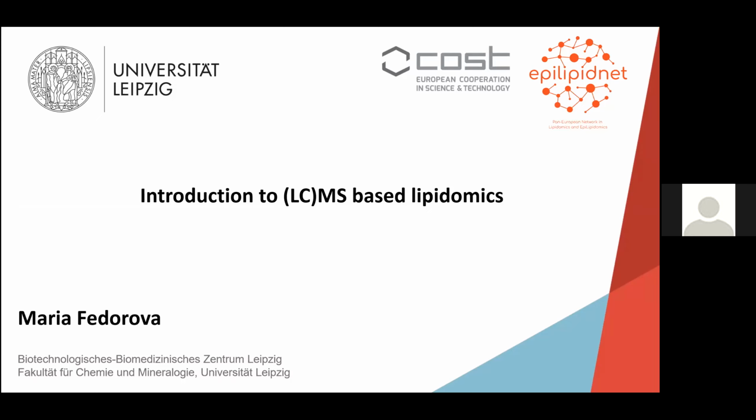I would like to mention from the very beginning that my talk will be really basic and meant to be just a general introduction into LC-MS-based lipidomics, because after my talk we will have a whole series of excellent presentations today and tomorrow which will introduce you much more deeply to how we can analyze lipids and lipidomes in general using mass spectrometry. For some of you who are dealing with mass spectrometry already, that might be too basic, but just to set the stage for every one of us here, let's have a look.